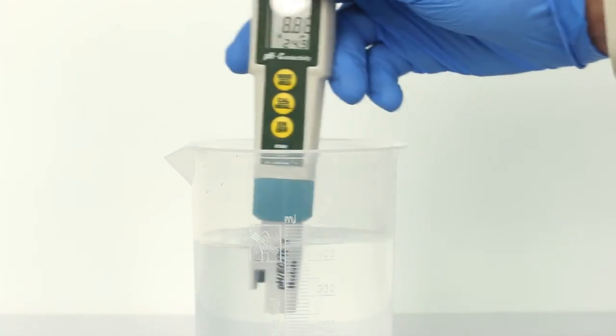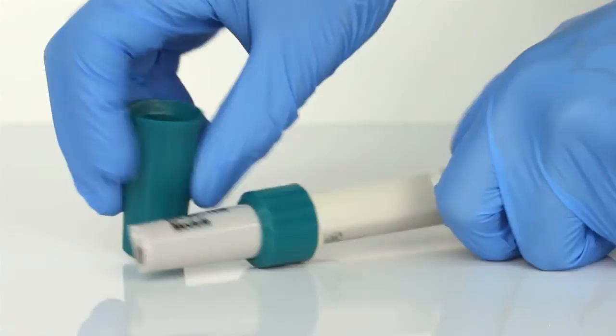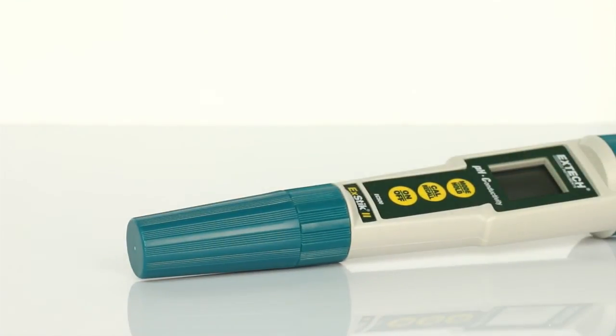Properly rinse the electrode after use. To preserve the pH electrode life, keep the sponge in the protective cap soaked with pH 4 buffer solution.